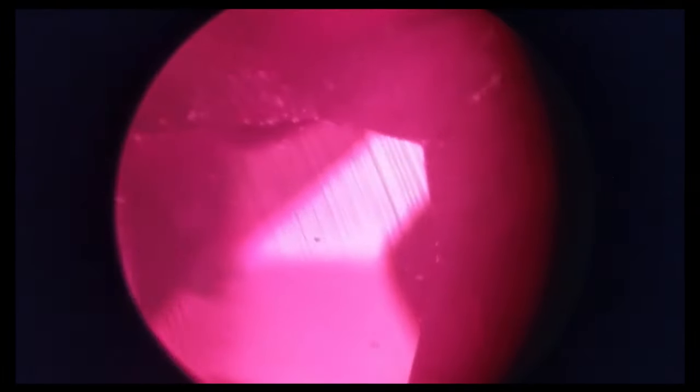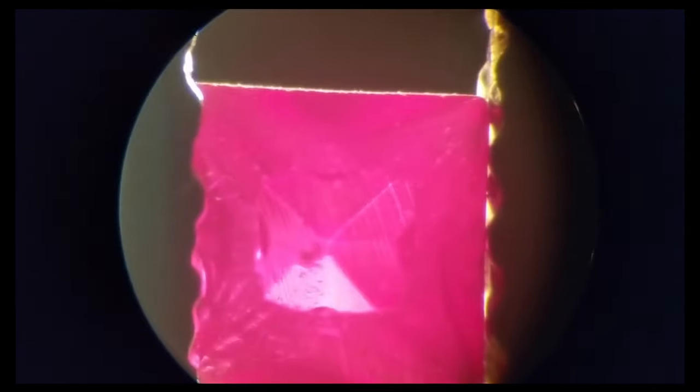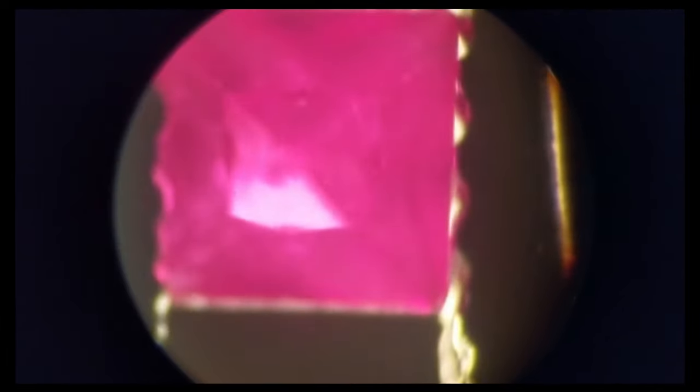Let me show you a second video of a more close up of this and as you can see in the second video right here you can see the curves going from up to down and going throughout the stone in parallel lines, nice clean parallel lines.